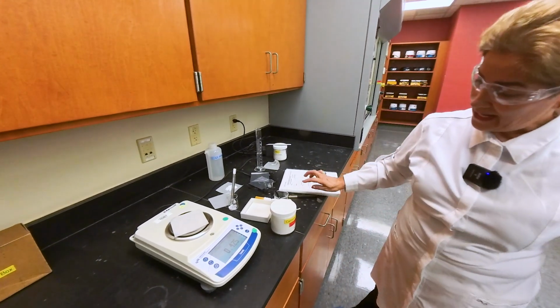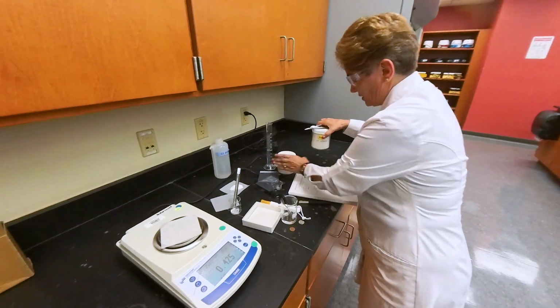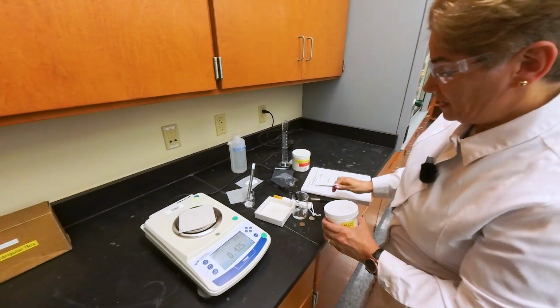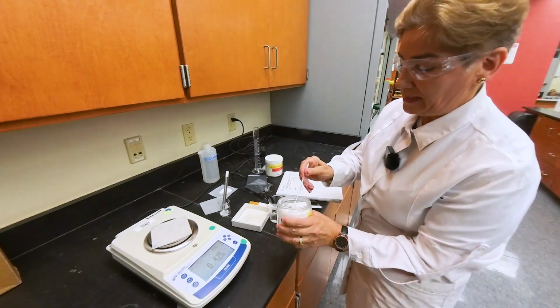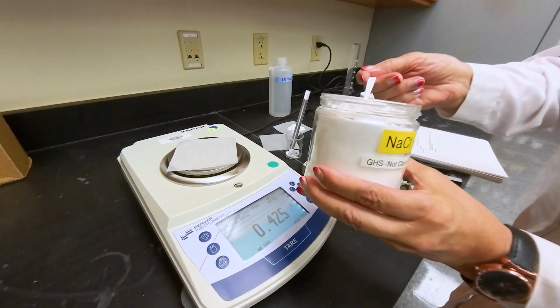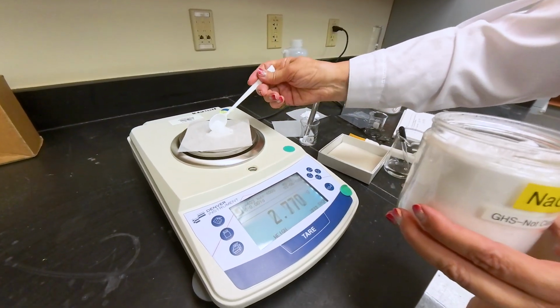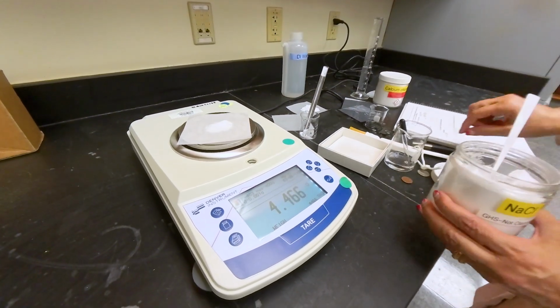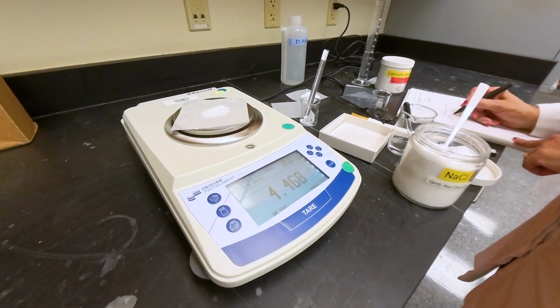Then I start adding spoon by spoon, so which is the first spoon. So I add 1 spoon of the sodium chloride, which is the table salt, to the weighing paper, and I record the mass after adding the first spoon.